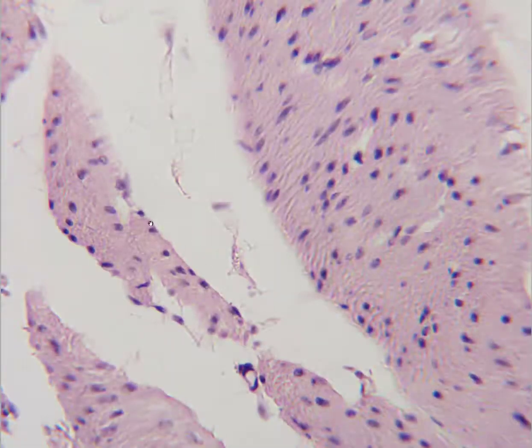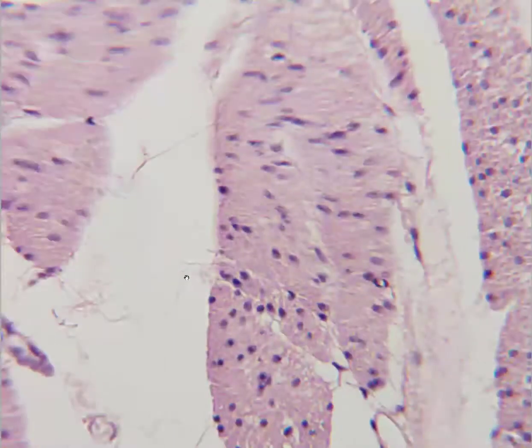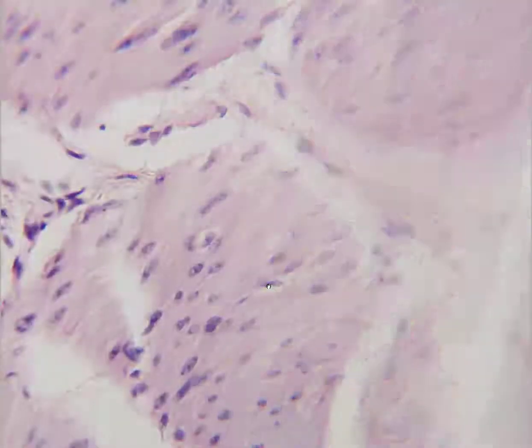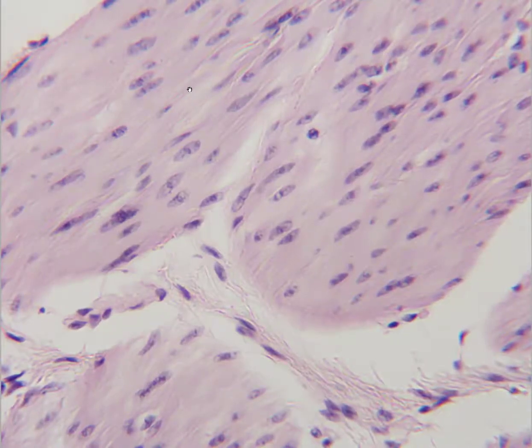If I keep looking around, this looks kind of obliquely sliced here. These are coming out of the plane towards you. You can see that it's hard to see the tapered shape of the cell now, and the nuclei look more round because you're cutting them in cross section. Typically, when we look at this in this lab, we're going to be looking more in the longitudinal section. So we're going to be seeing cells that look more like this. So this here is a very good example of our smooth muscle tissue.